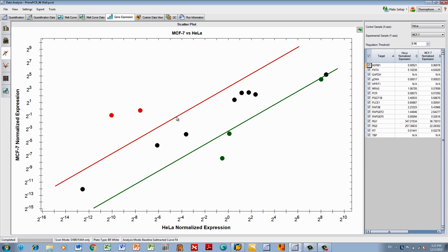As with the clustergram, high expression change is in red, low expression change is in green, and no change in expression is in black.